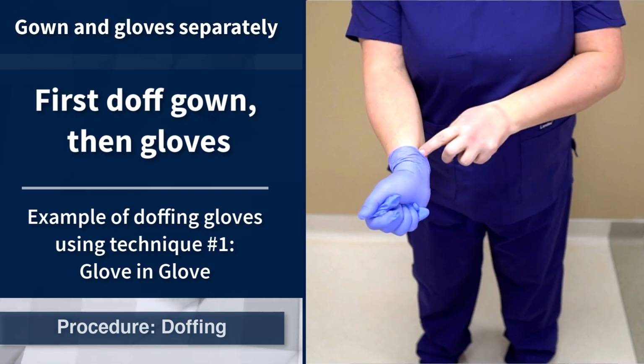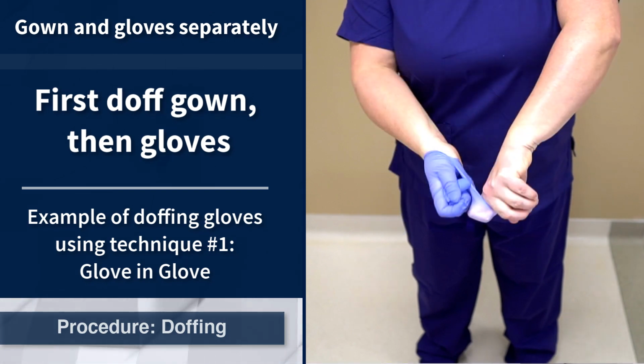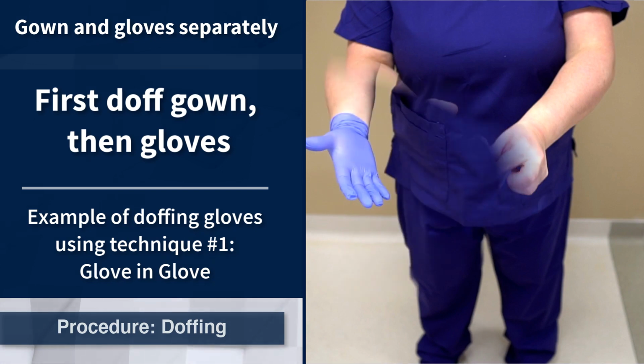Slide the forefinger of the non-gloved hand into the wrist of the other glove and pull it off. Make sure to only touch the inside of the glove and that the glove turns inside out and envelops the other glove.